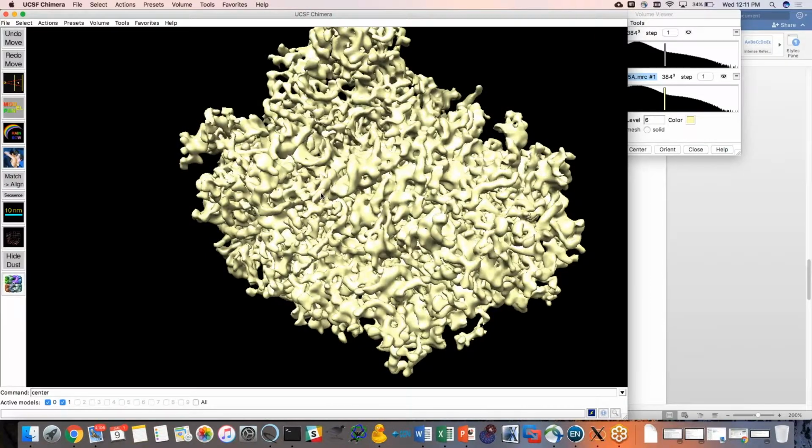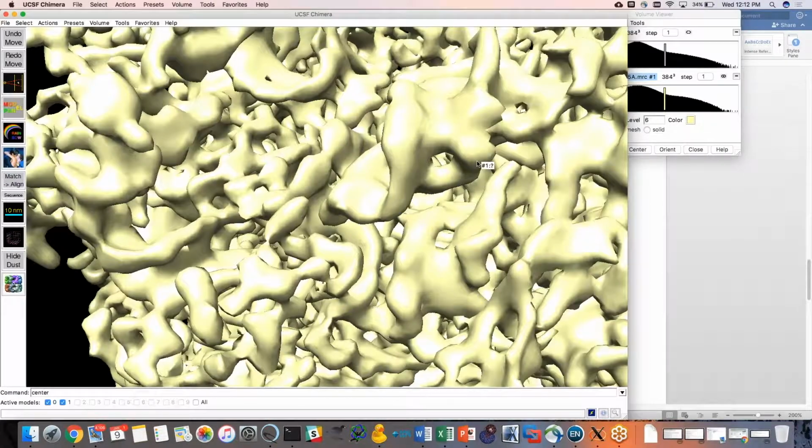Like we can zoom in on this. This is a helix here, and so if you're really well versed with this, yeah, exactly. So we got the hand wrong. This is an inverted map, and in the data processing pipeline, it's difficult to distinguish between the handedness of the structure that's going to output.